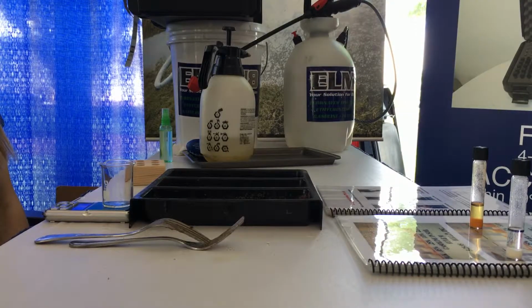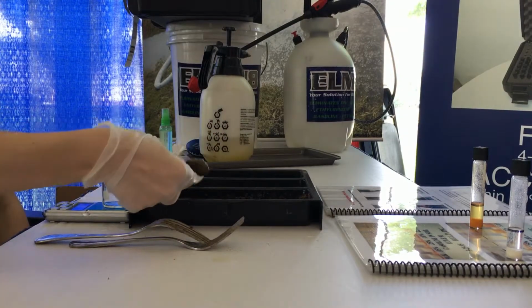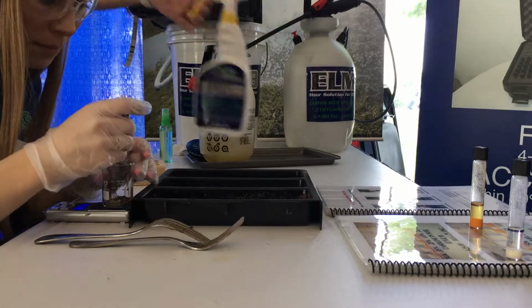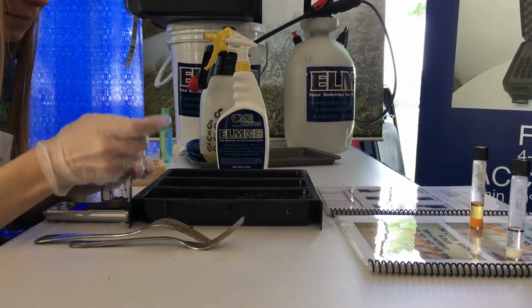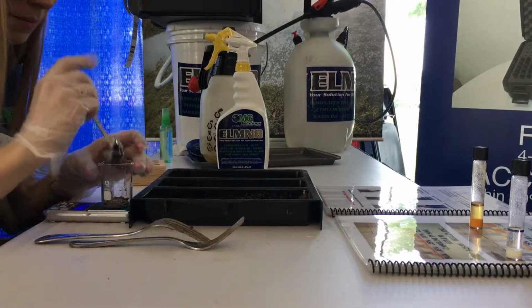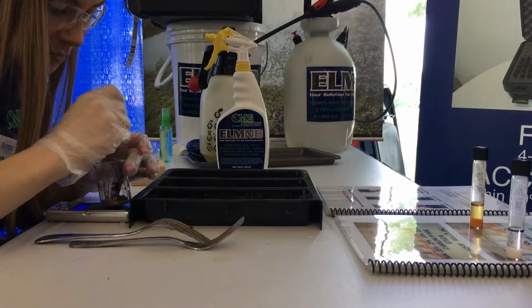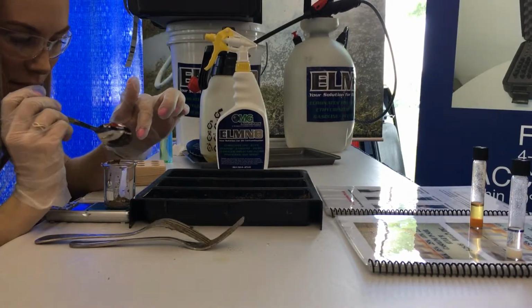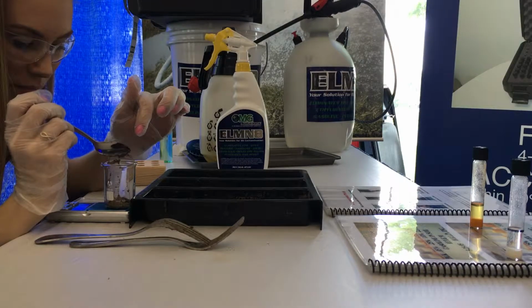Cleaning off that spoon that was contaminated by diesel with, of course, Eliminate. What else would you clean diesel contamination with? Measure out our 5 grams of soil. Of course, 5.0. A little bit heavy on the sample. See, there's a root there. If it were in your field, it doesn't matter. It's not going to affect the chemistry if there's a root in there or anything like that.